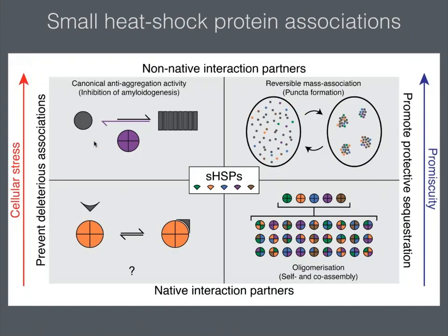So I'd like to finish then with a few minutes describing a biological problem that we've actually been tackling for a number of years. We've been interested in a series of proteins that are called the small heat shock proteins. They're an important part of the cell's tolerance and response to stress. That might be environmental stress, or it might be stresses such as aging that lead to various disease states.